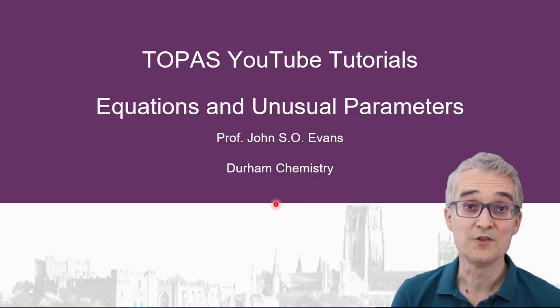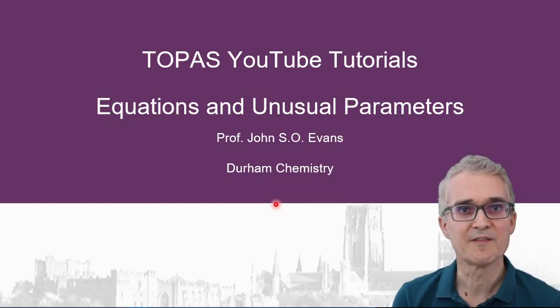Okay, so in this video I want to give you a very quick idea of how you can use equations in TOPAS to set up your own models for data analysis.